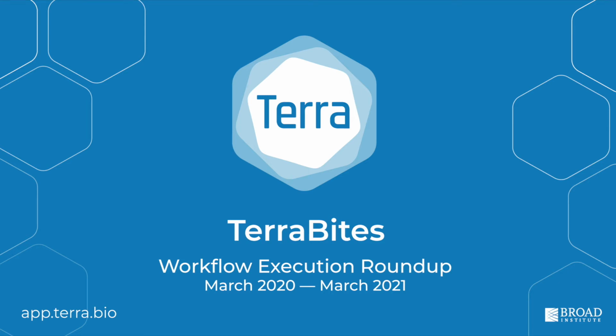Hi there, it's March 2021 and this is a roundup of new features and improvements to Terra's workflow execution capabilities that have happened over the past year.